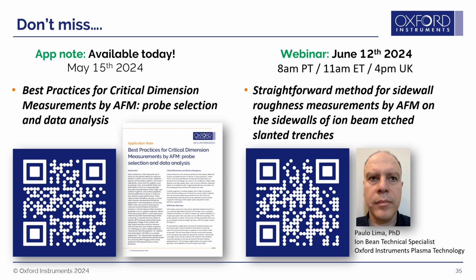I mean, depending on what is the interest of the sample. I can think of, in the examples we've seen, we had these areas which are silicon and other areas that are photoresist. So if you're interested in seeing whether the materials are different on different areas of your samples, your trenches, you could probably use mechanical imaging modes to see if there's any difference in the mechanics of the sample, which would give you information of which type of material is being used.